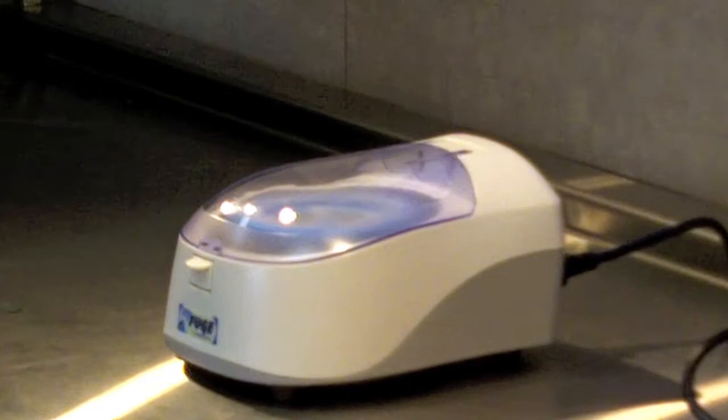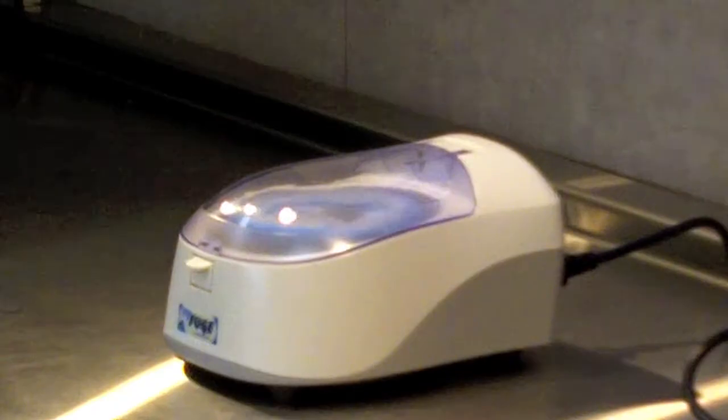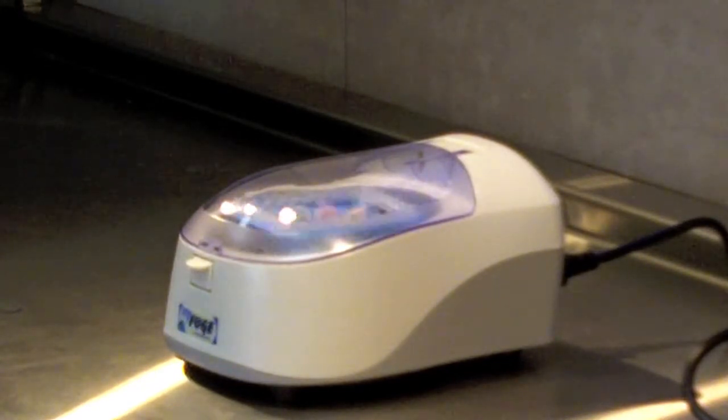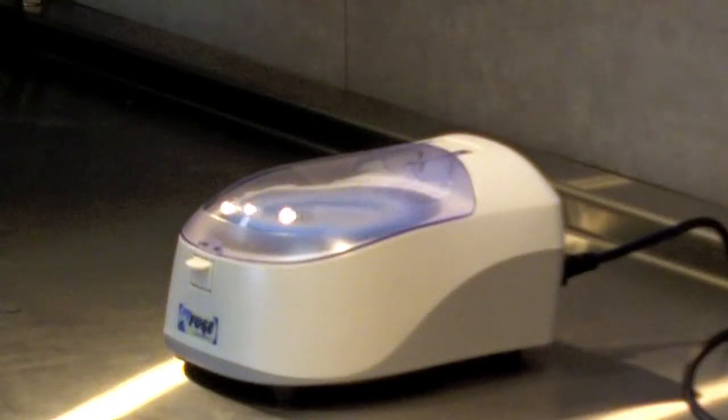You can also start and stop the unit by using the power button in the rear. When you turn it off, the unit will shut down even with the lid closed. And you can also start the unit by turning it on and the unit will power up.